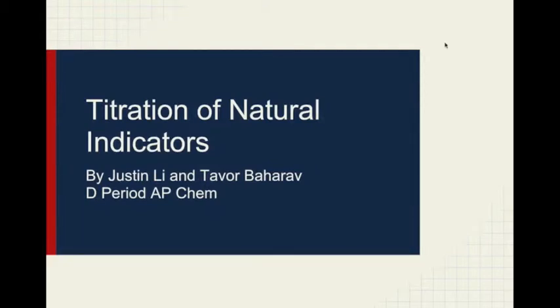Titration of Natural Indicators by Justin and Tavor, D period AP Chemistry.